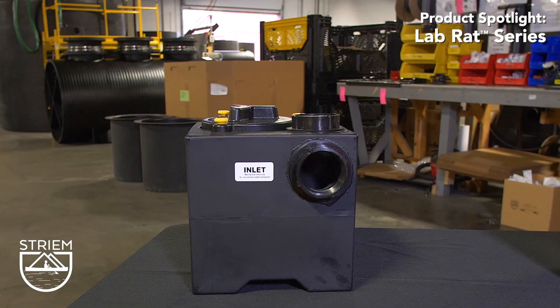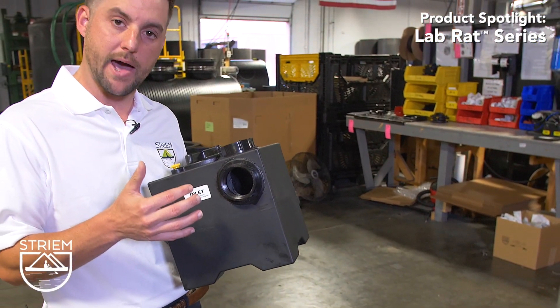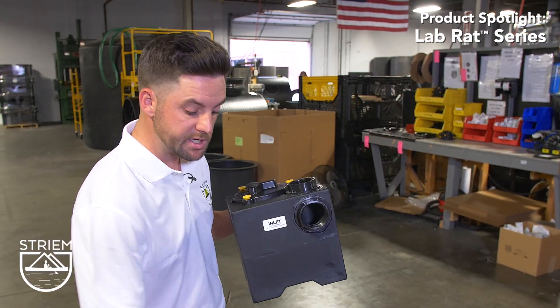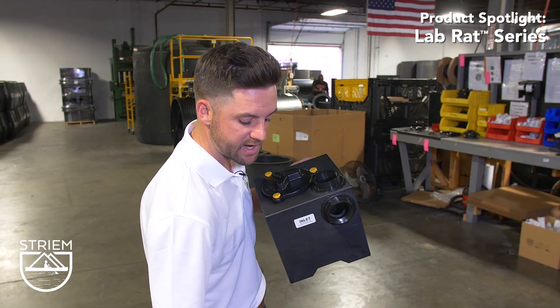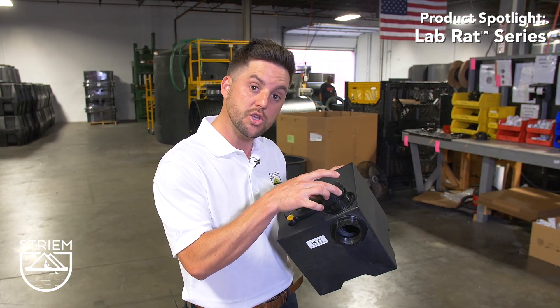Let's use the LB2 to demonstrate. The inlet and outlet are two-inch female pipe thread connections, with a built-in optional top inlet. Included with each tank are two 2-by-1.5-inch threaded adapters, should your piping system require inch-and-a-half connections. Also included with each tank is a plug to cap your unused inlet.